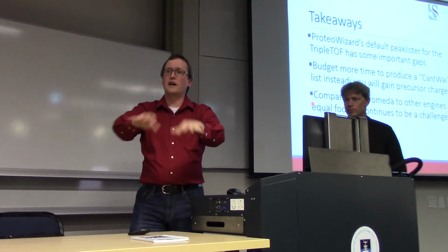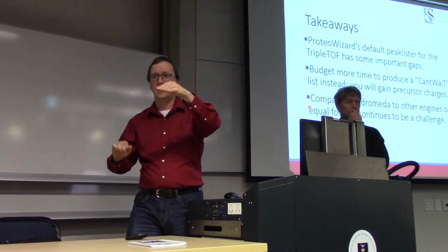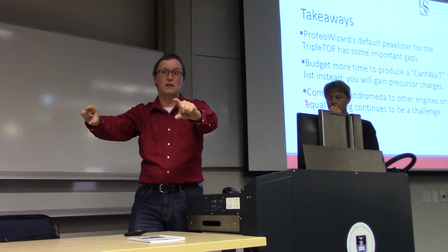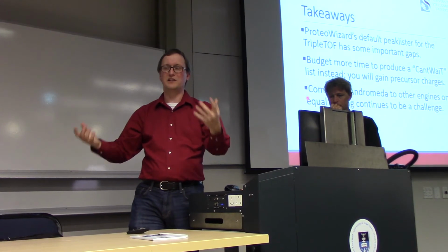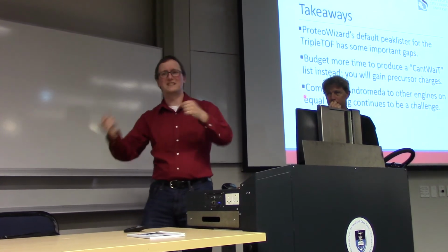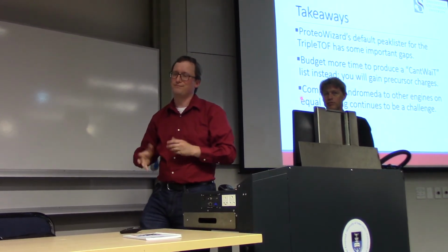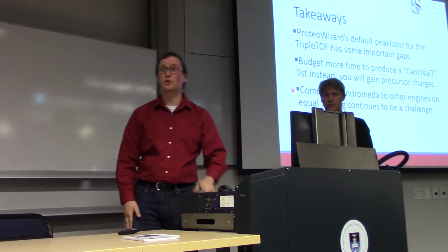Not to delve into fragmentation chemistry a whole lot, but the way that we do CID in HCD and the way that we do CID in a TripleTOF are both beam-type CID. So I should expect that the fragmentation processes are similar. The detection efficiencies by m/z are different, I should expect. So I don't know to what extent you can extrapolate from a QTOF, from an HCD spectrum on a Q Exactive to a TripleTOF tandem mass spectrum. I don't have experience there, and I'm not sure what the chemistry would look like. Good question.